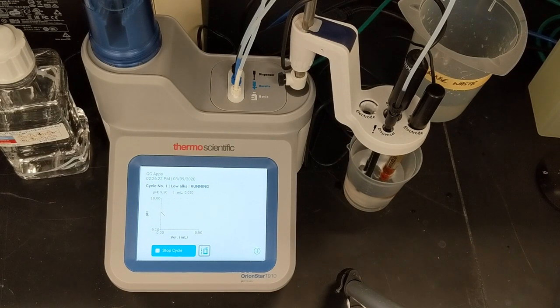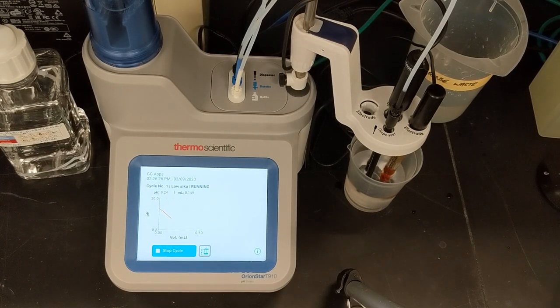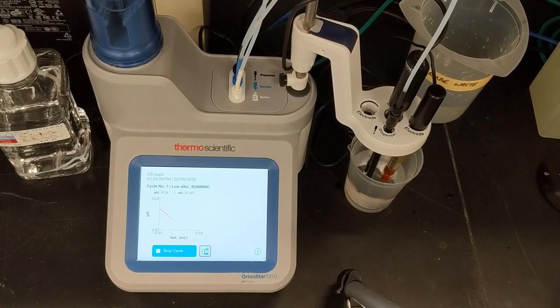The process continues until the titrator senses the two programmed endpoints at pH 4.5 and 4.2 and ends the titration. Then I can calculate the low-level alkalinity according to Standard Methods 2320 Section 5b.